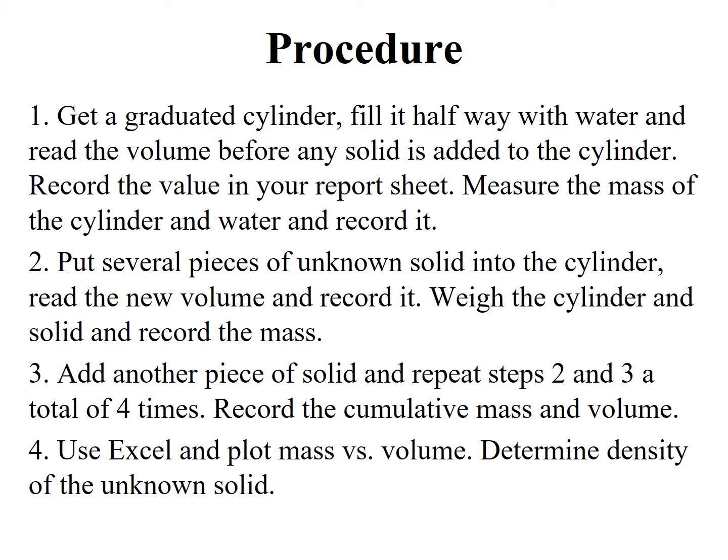Then you continue, adding another piece of solid and repeating steps 2 and 3 a total of 4 times, and then you record the cumulative mass and volume. Once you have that, you use Excel and plot the mass versus the volume. Determine the density of the solid.